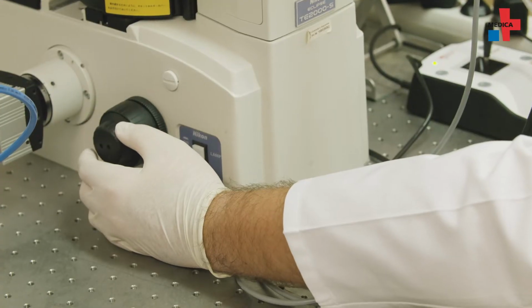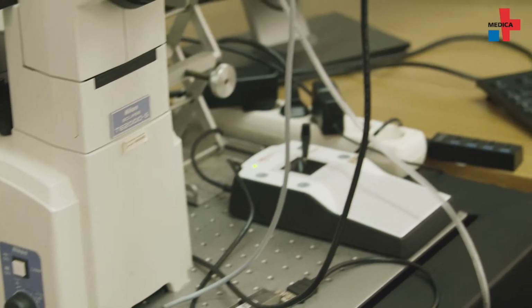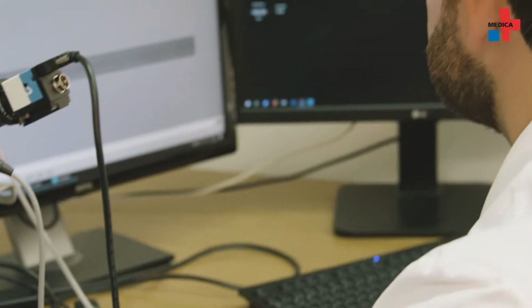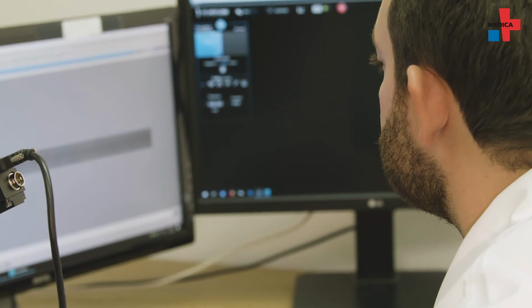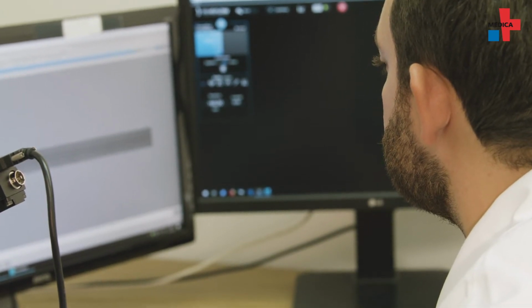Presently, the classification and characterization of cells from microscopic images still involves an experimenter who studies the individual cells and determines the shape or class of the cell. This classification is frequently prone to errors because the process is based on a subjective assessment. The research group led by Quint and Kihm has developed an analysis software that significantly improves this process.